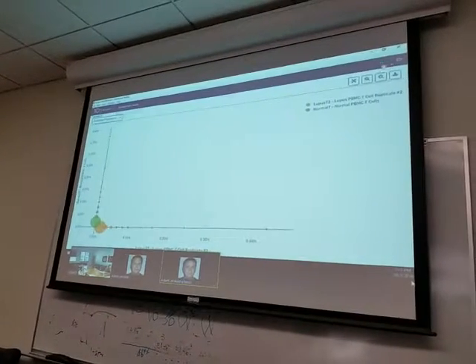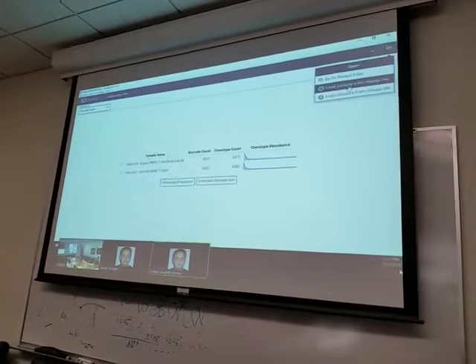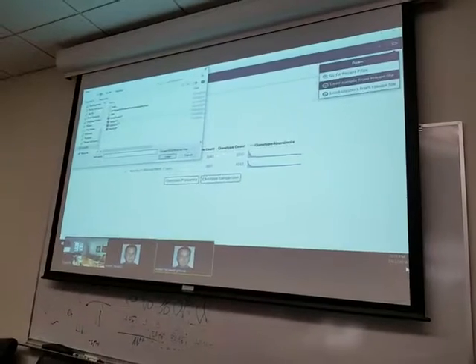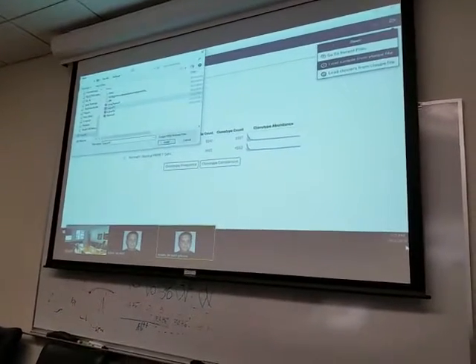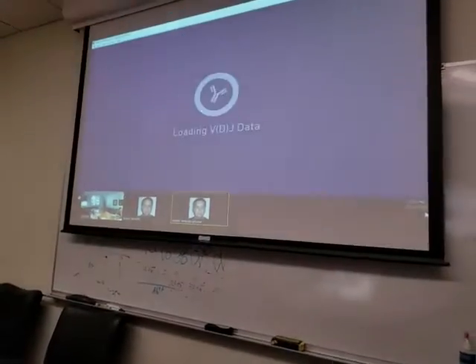However, if I load in some technical replicates, and again, I can point you to tutorials on all this, so it's just a bit of a crash course here.